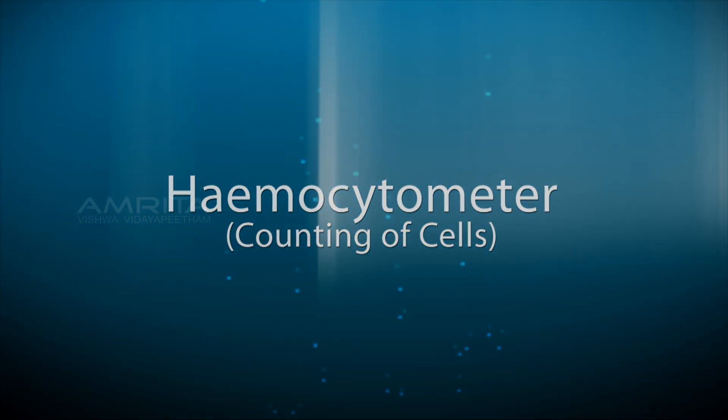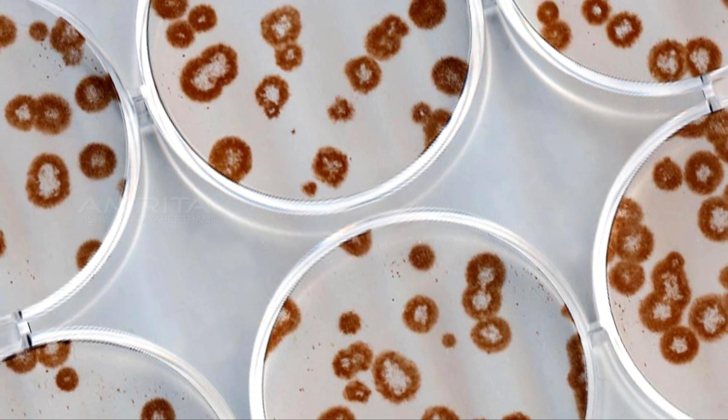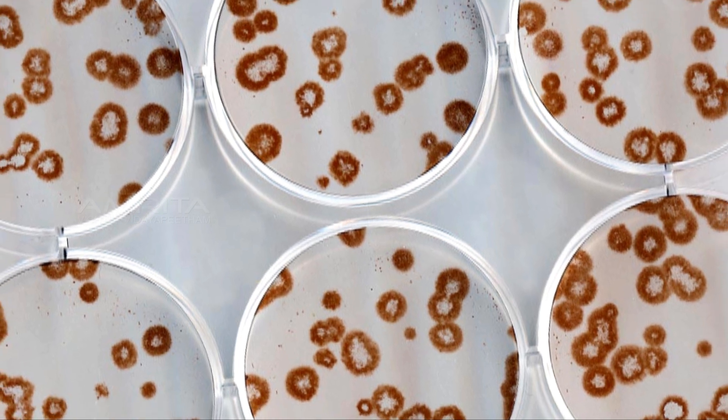Hemocytometer counting of cells. The object of the experiment is to determine the concentration of cells in a given sample.